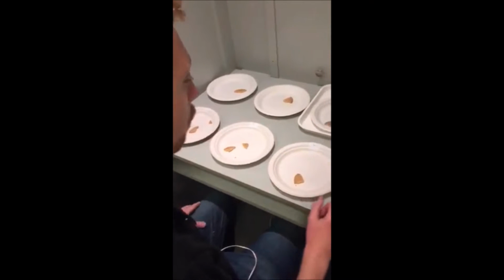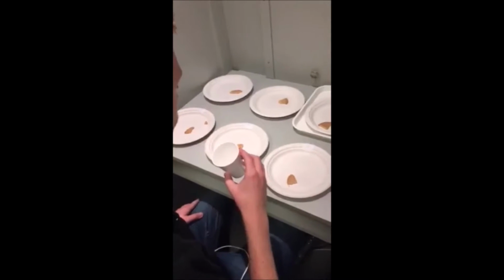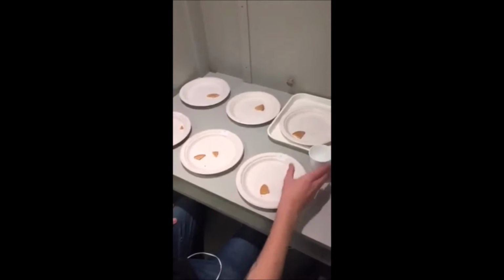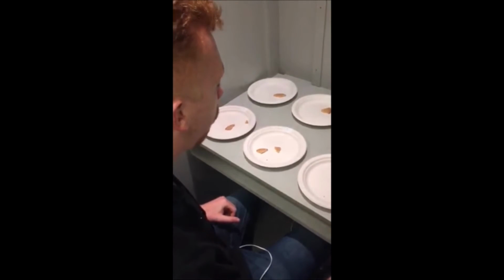Set 1 and Set 2 are presented to the panelist as follows. Set 1 starts with sample 133, then sample 535, and then sample 397. Set 2 starts off with sample 944, then sample 046, and finally sample 418.